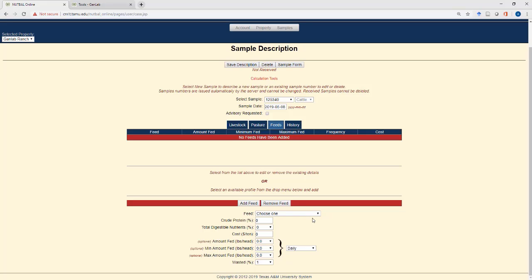If the hay is not removed 48 hours before taking your sample, the diet quality predicted in the fecal sample is going to reflect the hay's contribution to overall forage quality, because that hay is going to show up chemically as a grass or forage constituent of that cattle's diet. If you would like to evaluate the pasture forage only, so to see what your pasture looks like without any of the hay that you're offering, then you would want to remove the hay from the animals at least 48 hours before sampling, just so that that fecal sample truly represents just the grazed forage intake.